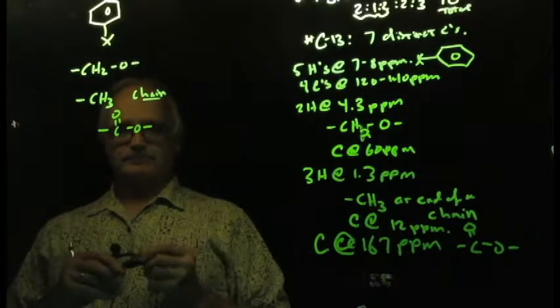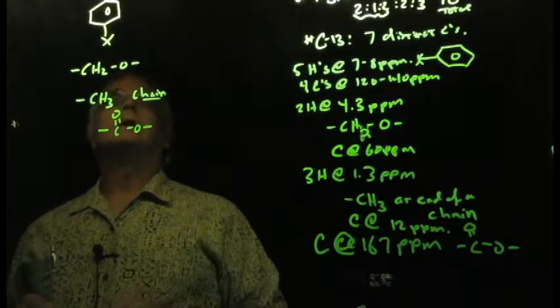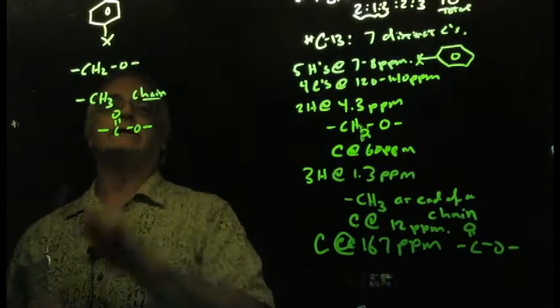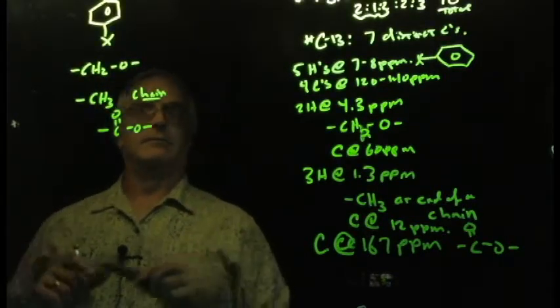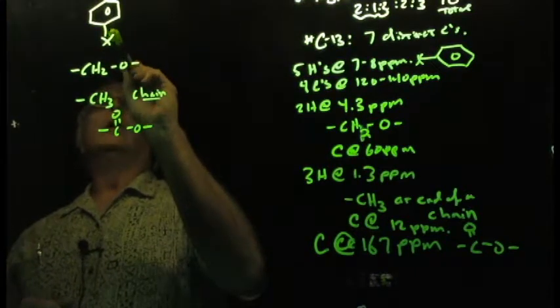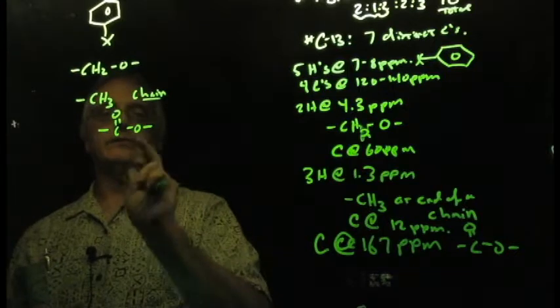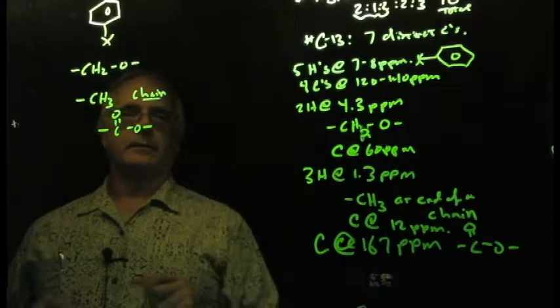I look over what I've written up here. Oh my, 1, 2, 3, 4, 5 protons, 6, 7, 8, 9, 10. 1, 2, 3, 4, 5, 6, 7 carbons.